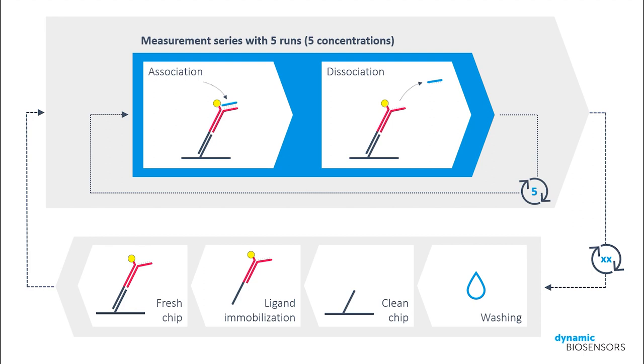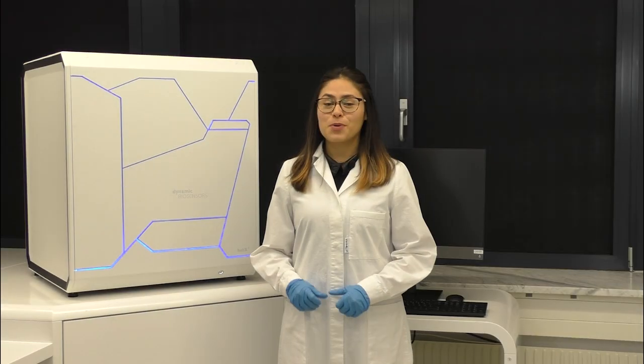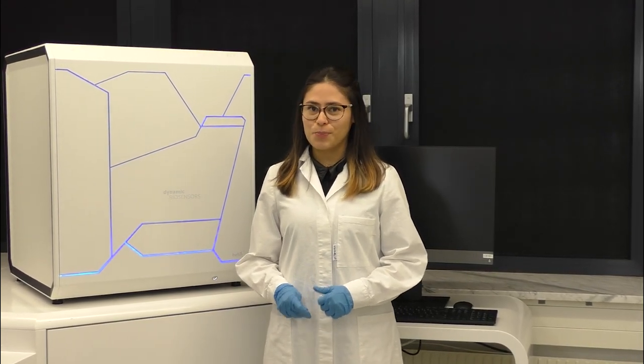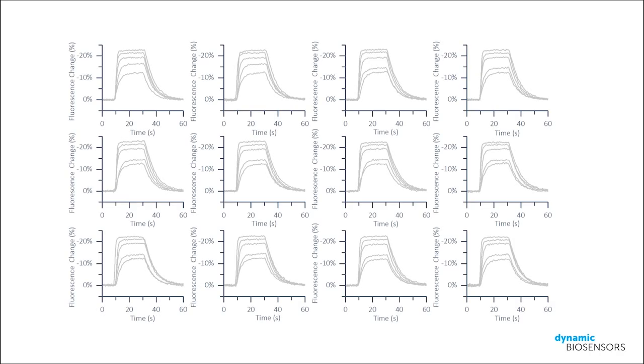We just need to enter how often we'd like to repeat the experiment and make sure the well plate in the auto-sampler contains enough analyte ligand solutions for all of the runs. I have prepared samples for 14 experiments and already started the repeatability run. All 70 runs were completed successfully and stable signals were observed for all measurements. Let's examine the statistics of the analyzed rate constants.